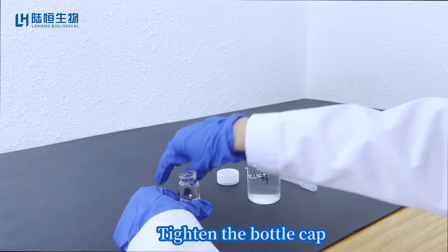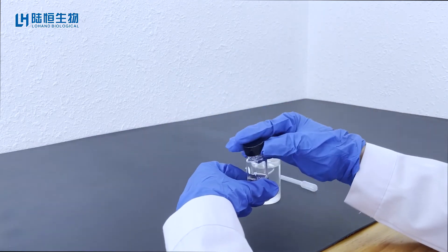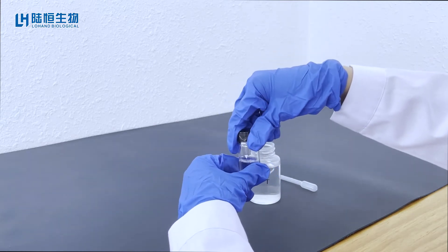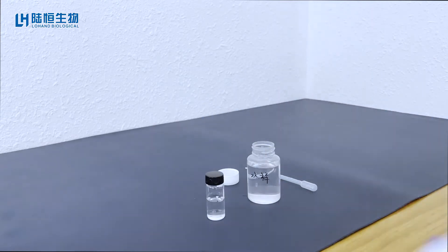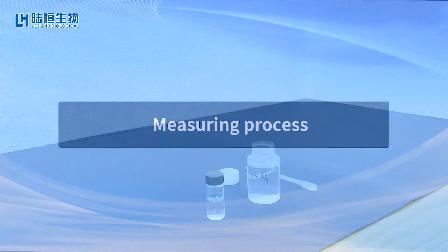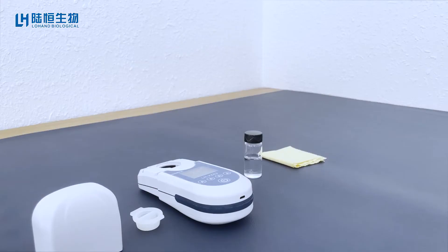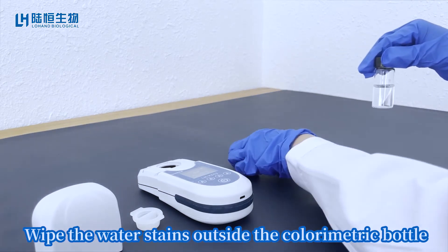Tighten the bottle cap. Wipe the water stains outside the colorimetric bottle.